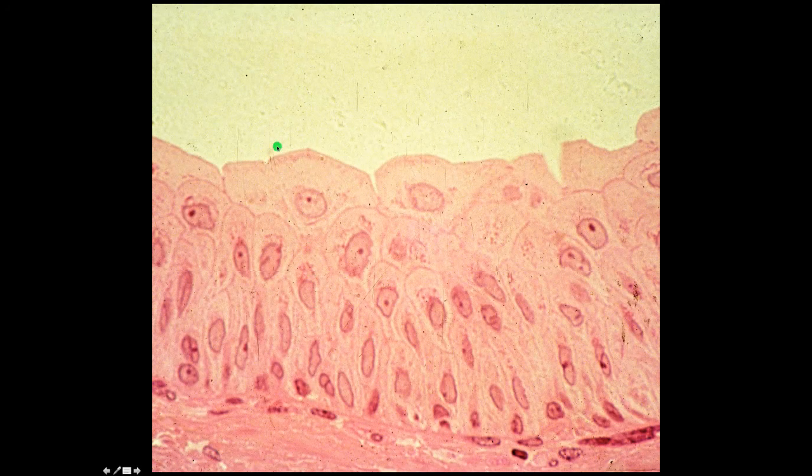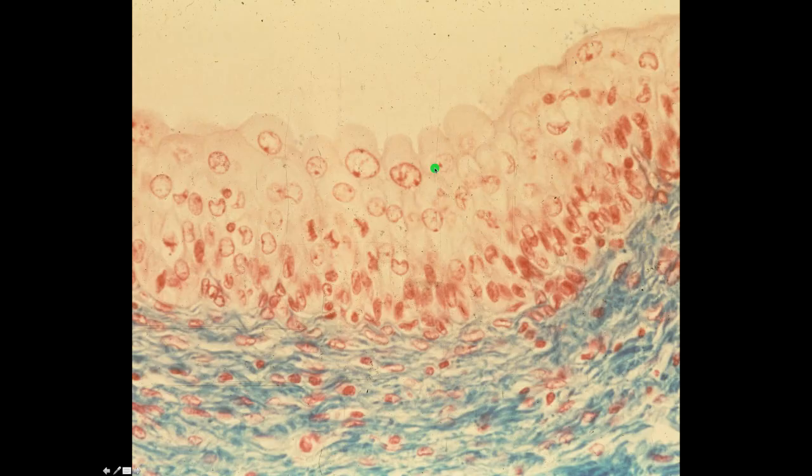Here is a transitional epithelium. This epithelium is unique to the urinary tract, so you might find it in the ureters or in the bladder or in the very proximal portions of the urethra. But very characteristic of this transitional epithelium are these very large dome-shaped cells that would project into the lumen. And here's another view of the same thing on this next slide.